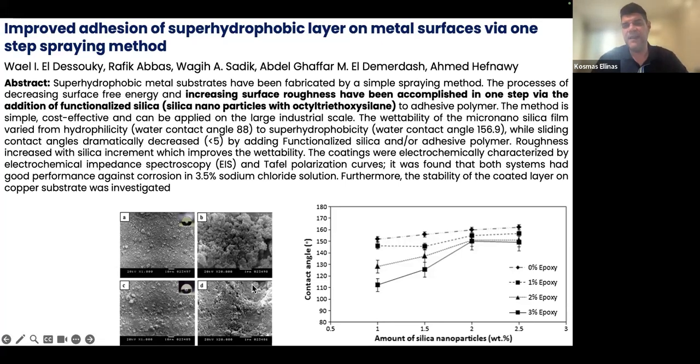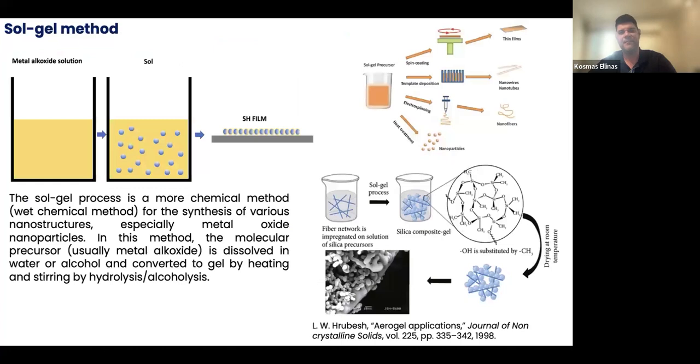So you can easily create coatings on the entire area or on specific spots of the area if you have done a lithography step, and create different types without using any really exotic, let's say, instrument to do the deposition of the material.